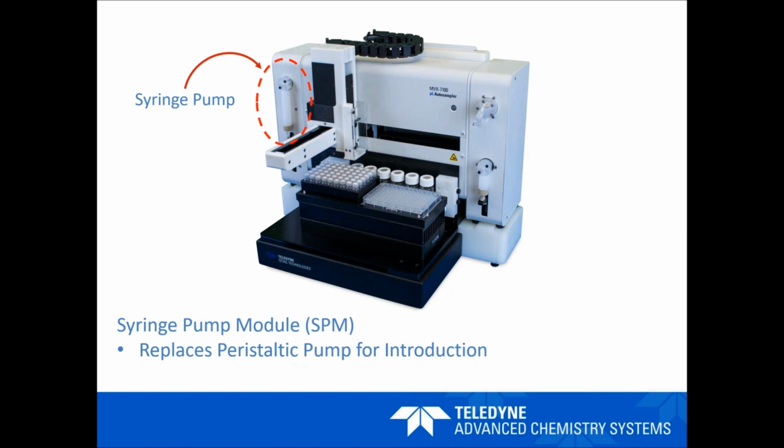Now this pump here is going to take the place of your peristaltic pump for sample introduction. Instead of using the peri pump, this syringe will push your sample off the sample loop and deliver it to your nebulizer and spray chamber for introduction. So the only thing that you're using your peristaltic pump for on your ICP-MS now is for draining the spray chamber.